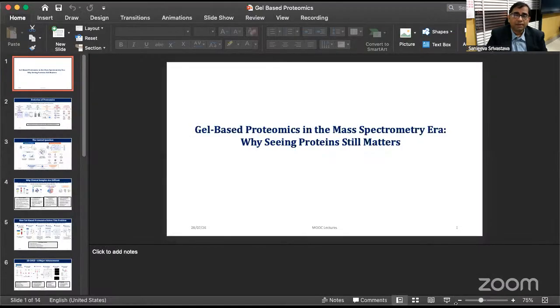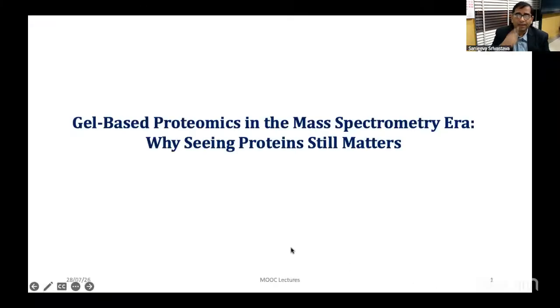All right. So while Arya is getting ready, the gels still have to go to mass spec. Even when we say gel-based proteomics, gels alone are not sufficient to give you the proteomic data. So we will still take them forward on the mass spec, regardless of whether you have the bands from the gel which you want to identify what those proteins are. So you will still look at the in-gel digestion of those proteins. And likewise, if you are looking at any type of complexes, you'll again take those spots and do in-gel digestion and look at those interactors. Arya, over to you now.